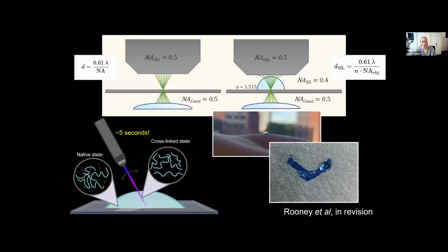At the other end of the spatial scale, we have a solid immersion lens, which we can make using very simple methods that don't even require a 3D printer. We take some of the 3D printing resin that's optically transparent. We deposit, using a Gilson standard pipette, a 7 microliter drop onto the sample. We cure it using a torch or a UV laser pointer, as long as there's enough UV light to cure the resin. It takes about 5 to 10 seconds.